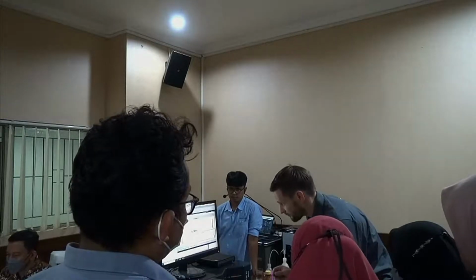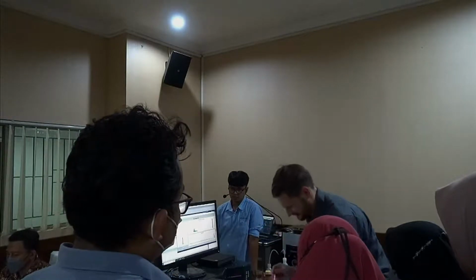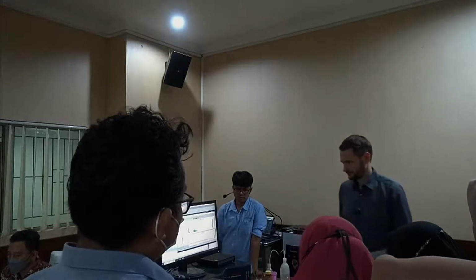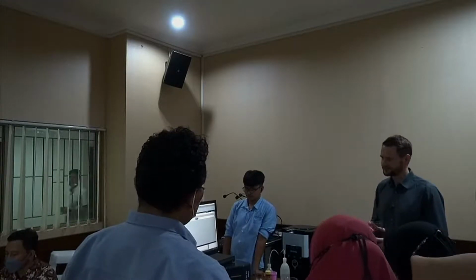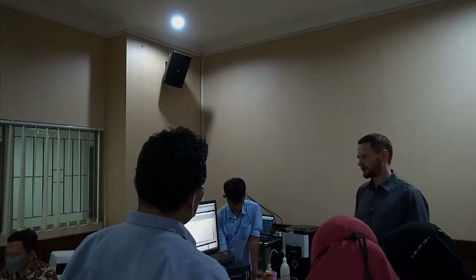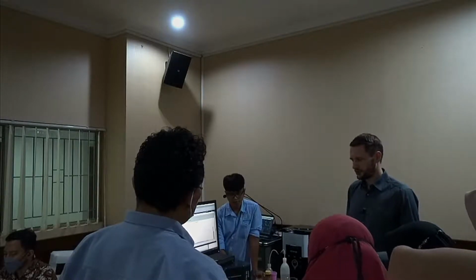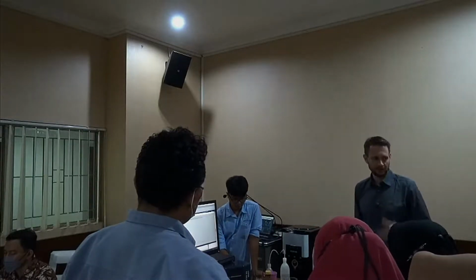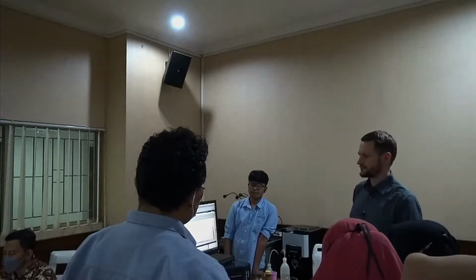One more drop, what do you think? Try a small one. It was not so small actually. So now we're making 2 measurements with no ultrasonic, and after that the ultrasonic will switch on, and we will wait 60 seconds in order to give the ultrasonic some time to work, and then we'll make another set of 2 measurements.